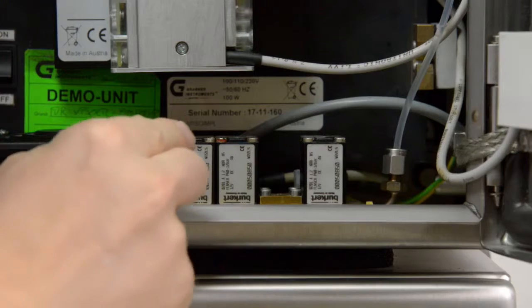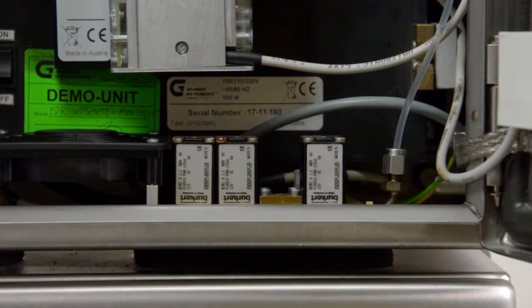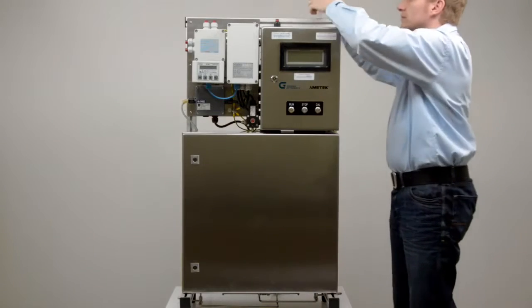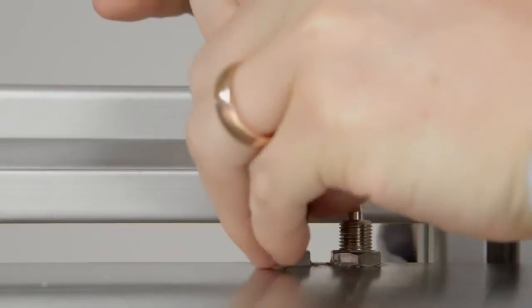The measuring cabinet contains 2 valves for different sample streams and 1 for the calibration fluid. To the top of the cabinet, external water cooling can be attached for additional cooling of the system.